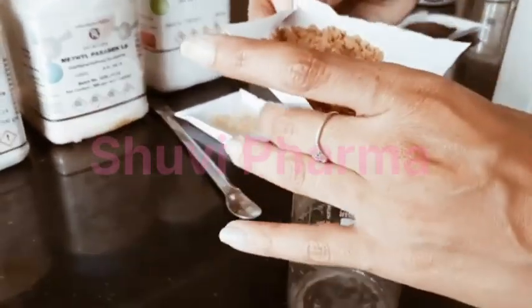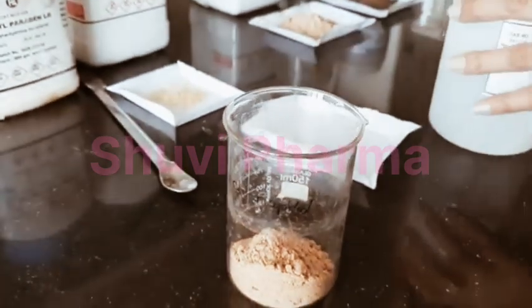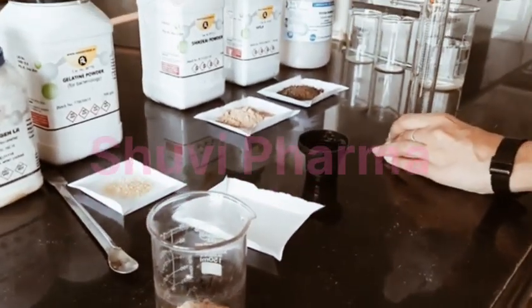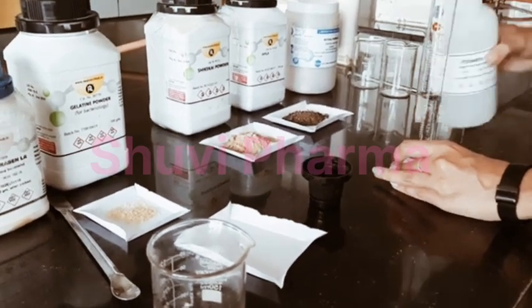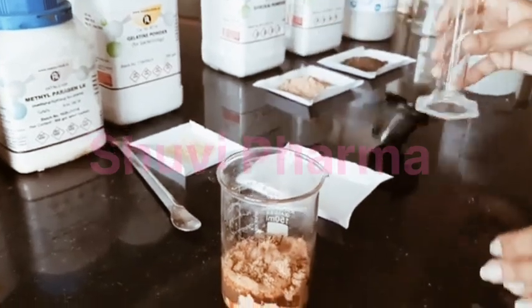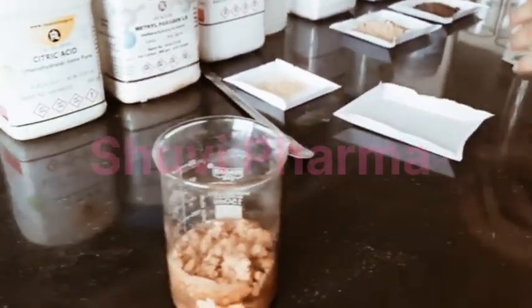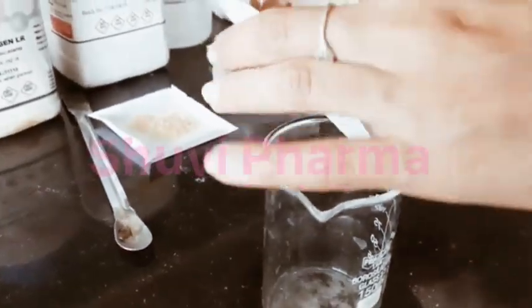So for preparation of Reetha extract, 10 gram of Reetha powder is taken. To that we will add 30 ml of ethanol. This is our Reetha extract. Now we will prepare the shikakai extract.